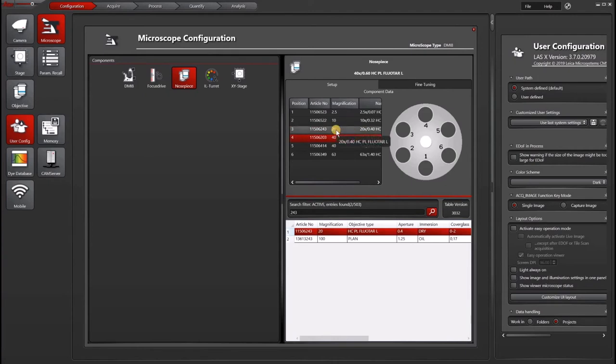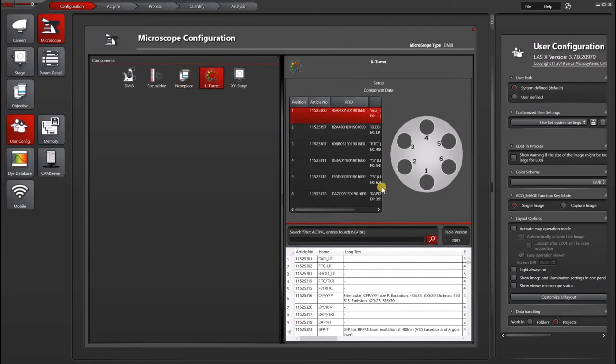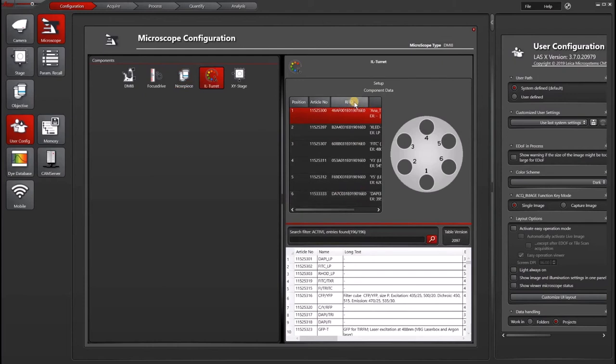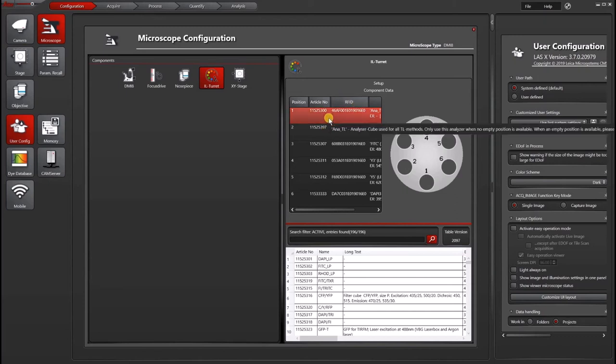Now to change your fluorescent filter cube, you can do the same thing. You can actually tell that on this particular microscope, it has RFID, which is a code that is read by the microscope stand. So it's intelligently designed such that you don't even have to enter the article number here. When you stick in the filter cube, it will automatically be read.